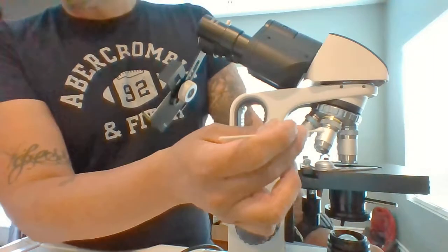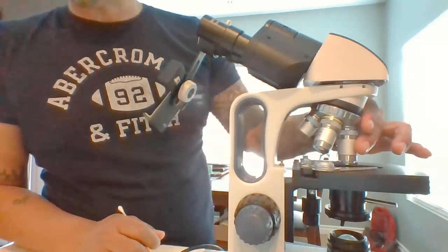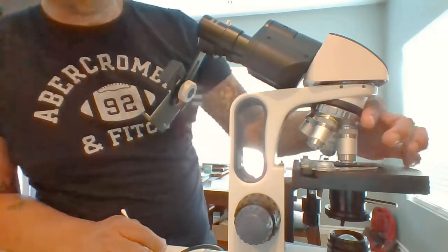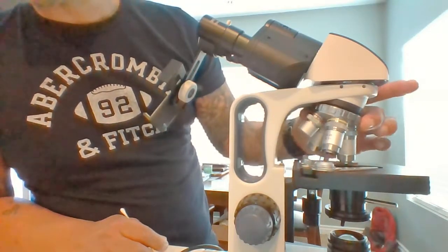These are the objectives. This will magnify the specimen at different powers depending on the lens, at 4 times, 10 times, or 100 times. And as you can see, these are the objective lenses here.